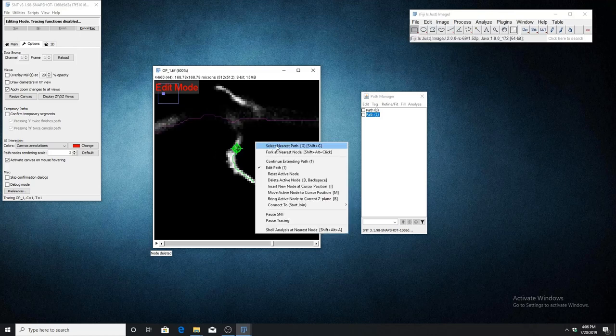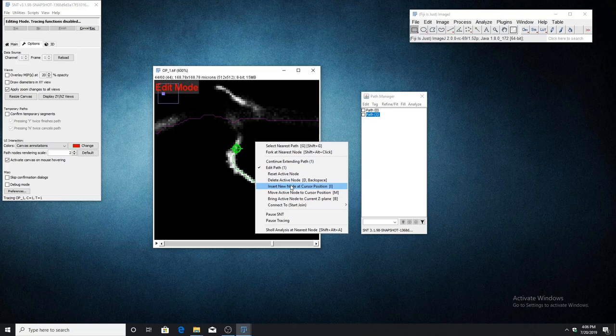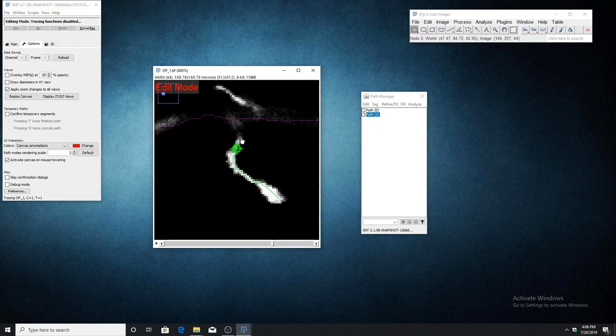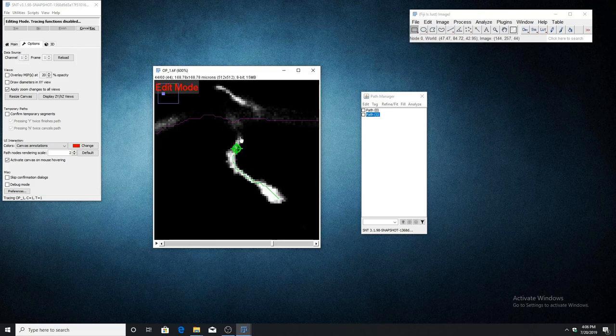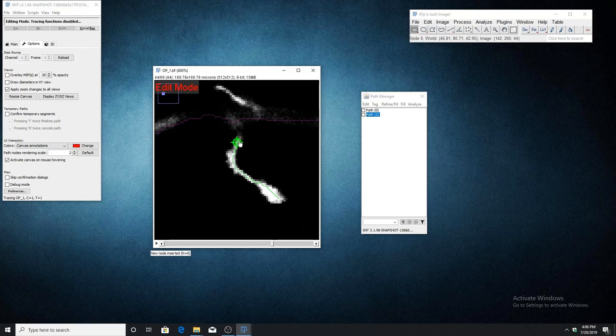The next feature is insert new node at cursor position with keyboard shortcut I. In the same way as delete, just hover over where you want to place the new node and press I on the keyboard, and it will insert a new node at that position.